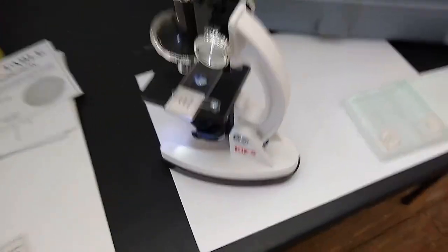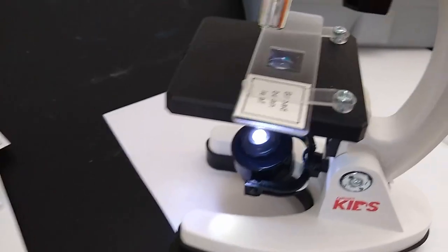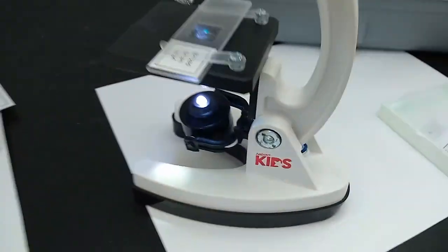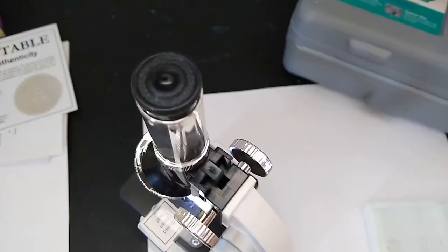So it comes with an instruction booklet where you can learn the parts of the microscope. Here's the microscope itself. Right now we have a slide in there of the broad bean leaf, and underneath this little thing just flips around to give a light so that you can see in through there.